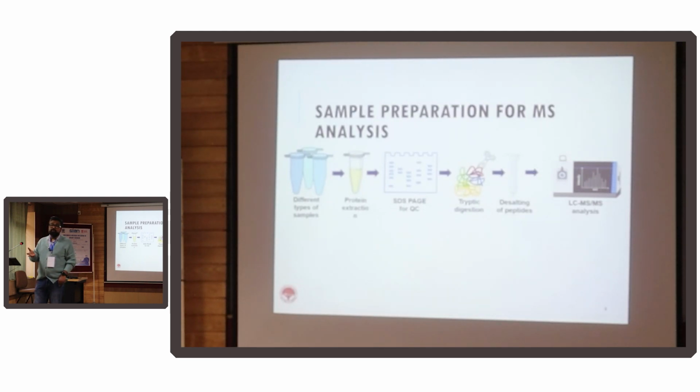And this is very important when we go back and try to trace back via bioinformatics tools like MaxQuant, MSFragger. There are multiple tools by which you can use the raw MS data and make sense of it, that is, which are the proteins that we have identified. That is very important. We will come to it.